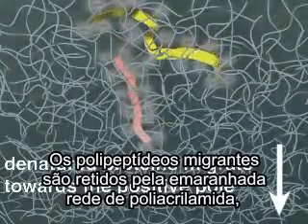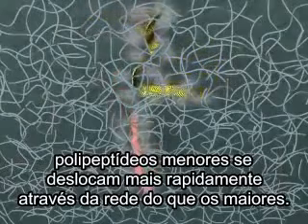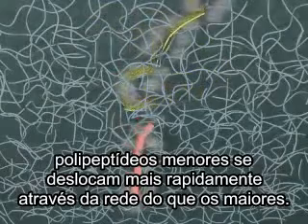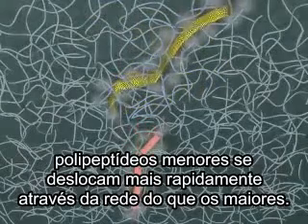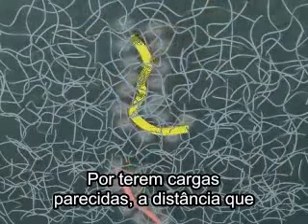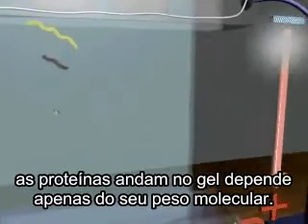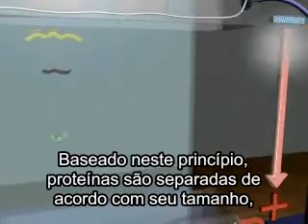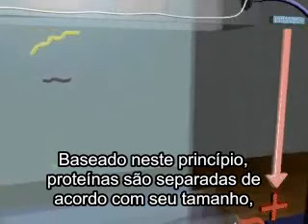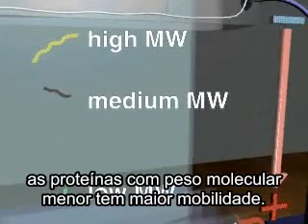The migrating polypeptides are retarded by the tangled network of polyacrylamide. Smaller polypeptides travel more easily and quickly through the pores in the network than do larger polypeptides. Because the polypeptides have similar charge to mass ratios, the distance they travel through a gel is dependent only on molecular weight. Based on this principle, proteins are separated according to their sizes, with low molecular weight proteins having greater mobility than high molecules.